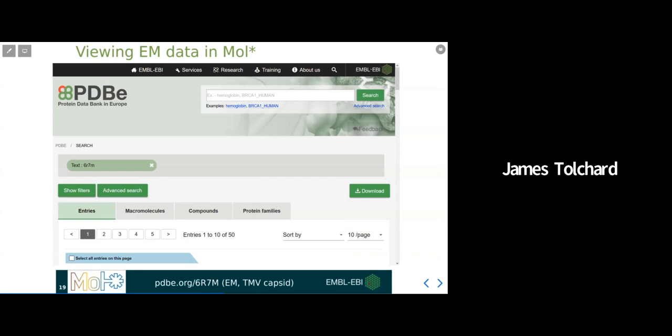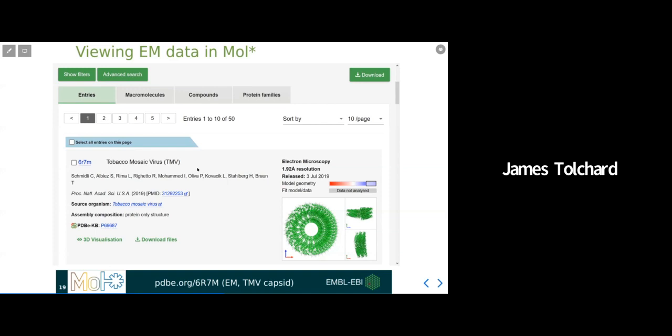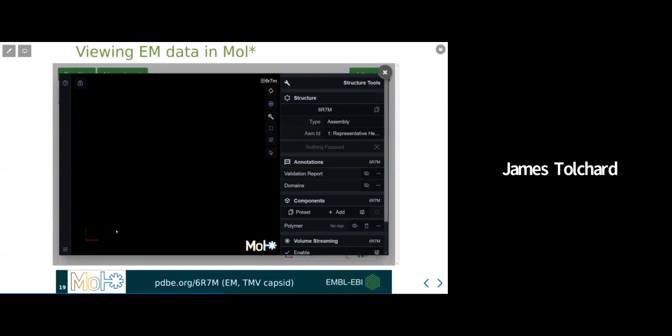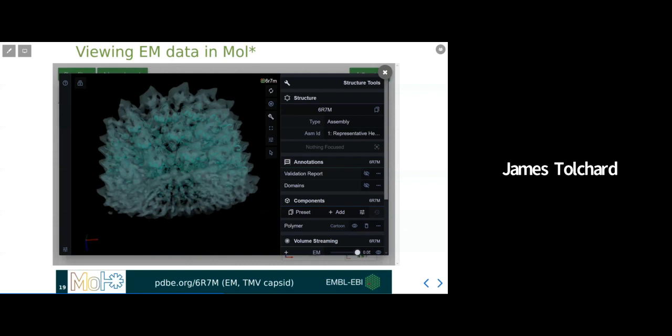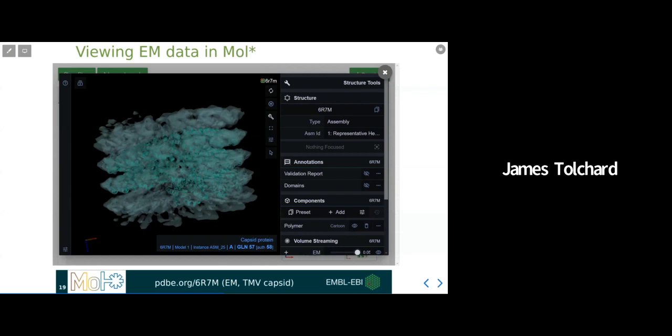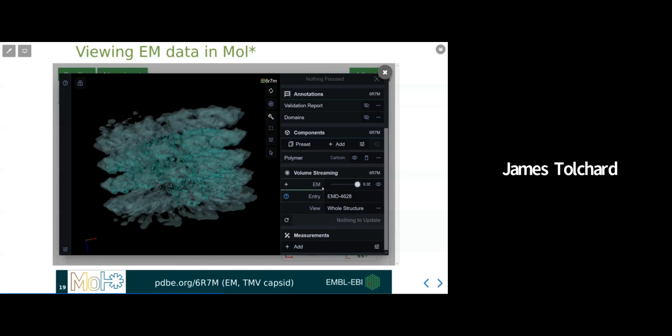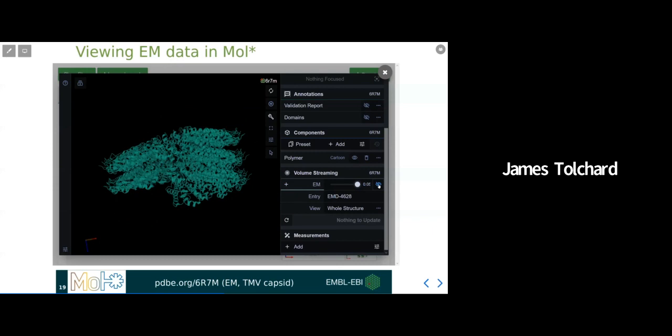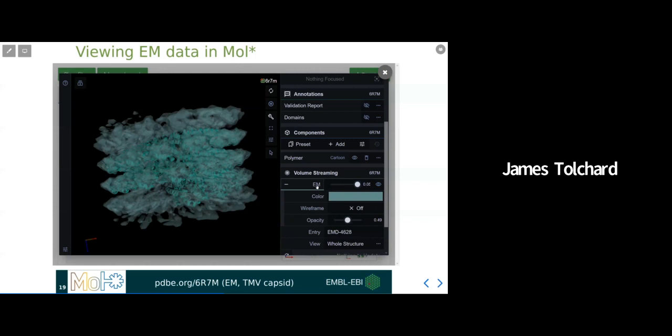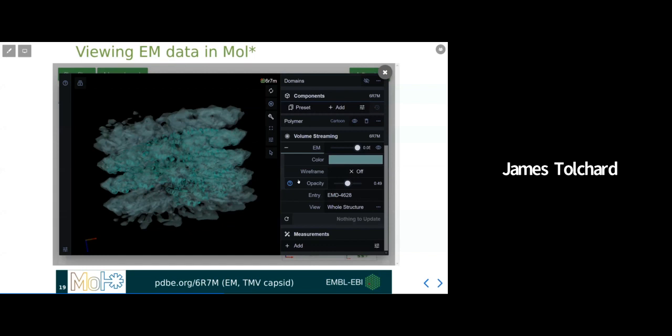In this example, we will open MolStar directly from a PDB search result. Here, you can see I have searched rather crudely for a text search for our PDB code of interest, 6R7M, which is a structure of a tobacco mosaic virus capsid. Now, directly from the search result, I can launch MolStar with the 3D visualization link. You can hopefully see how quick a version of the whole map has been loaded and visualized. This is default behavior for any EM entry. On the right-hand side, we can see the map settings and the volume streaming. For the primary map, we can choose to toggle it very simply on or off. By clicking on the EM tab, we can also change the color and representation of the map, the same way we could see the electron density data.